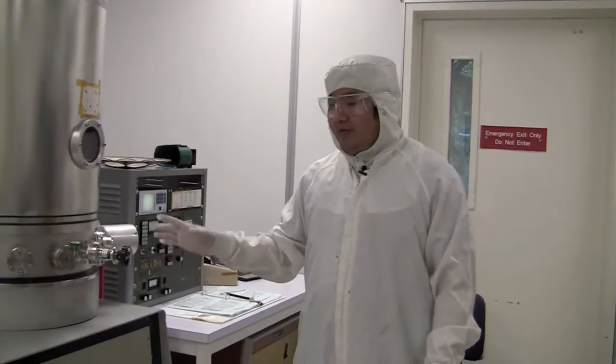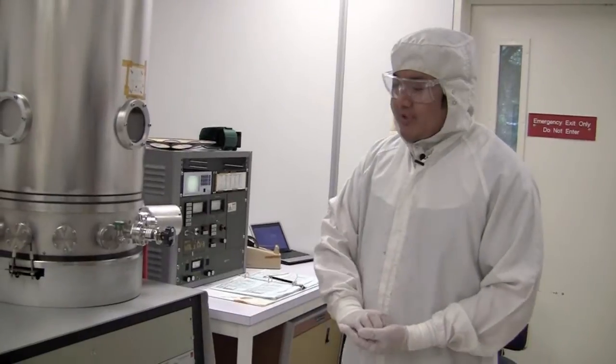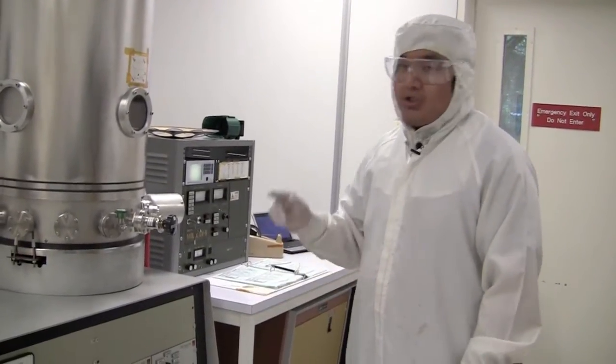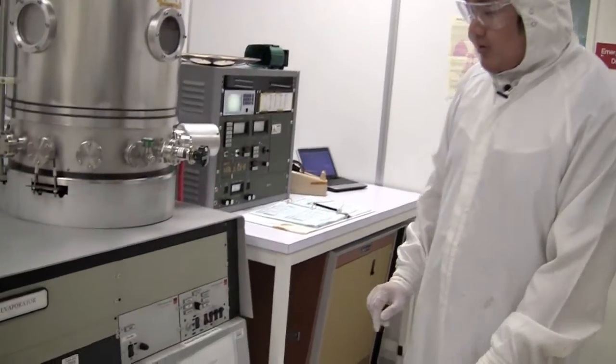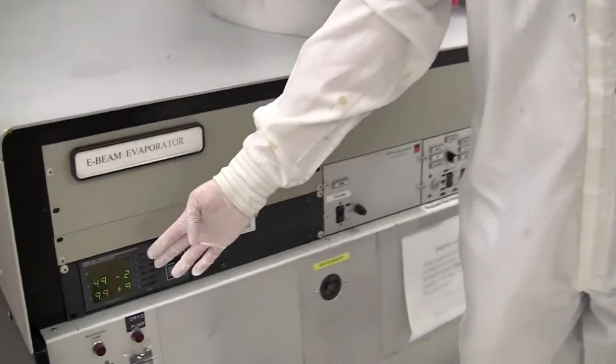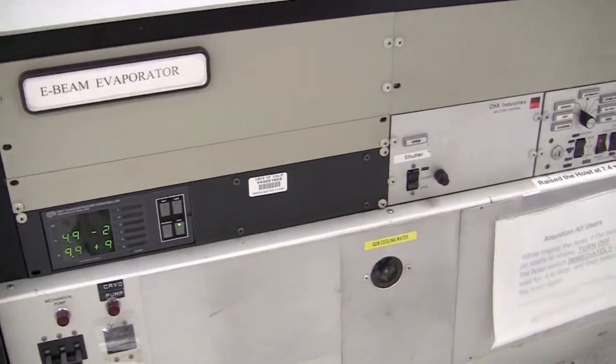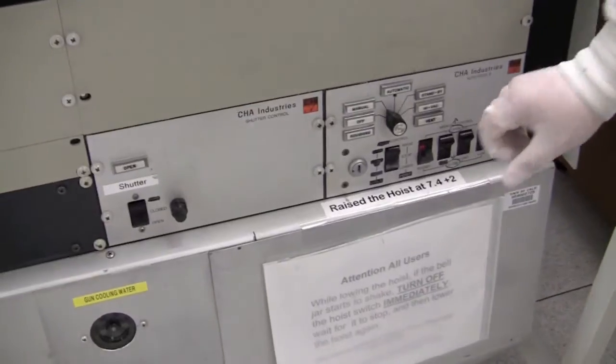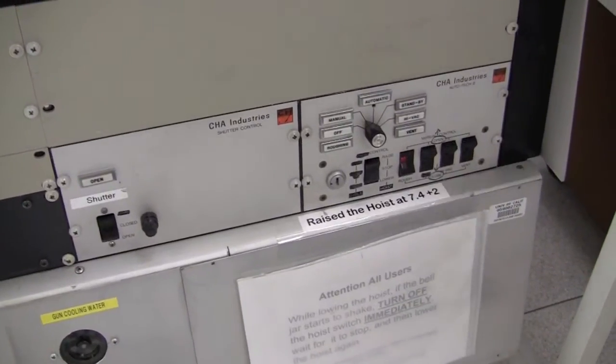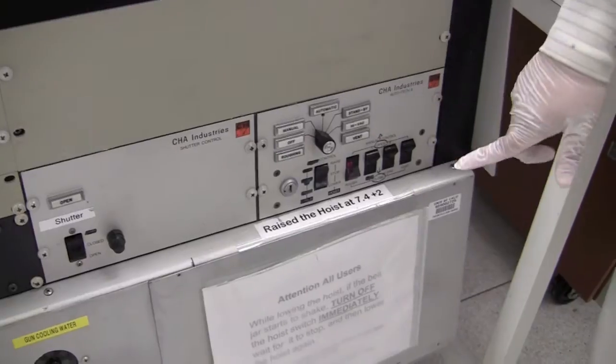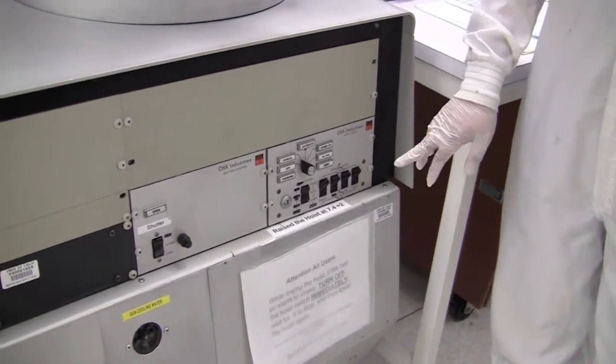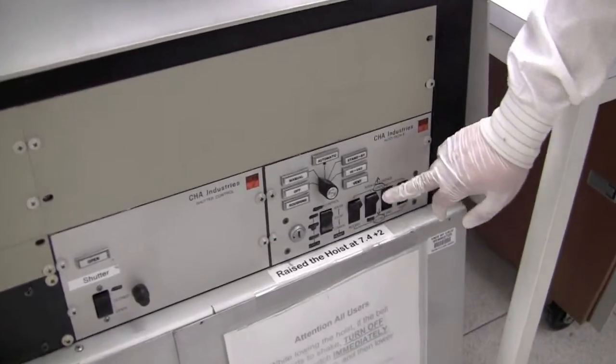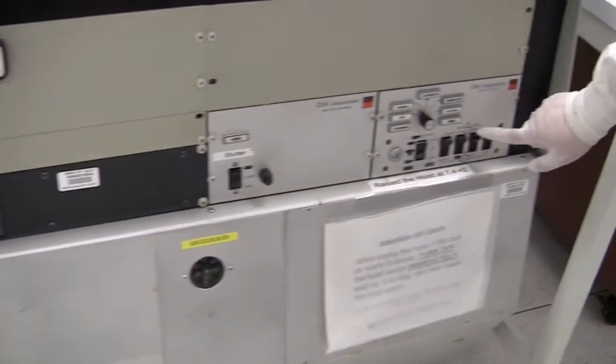So after the roughing pump has brought the pressure down to below 50 millitorr, we can switch the mechanical pump off for the roughing and turn on the high vac. So what we do is we look at the pressure, it's under 50 millitorr, and now we're going to turn the rough off. But once we turn it off we wait a little bit for the actuation of the valve to make sure it's closed, and then we turn the high vac on. When we turn the high vac on you should see the pressure drop.